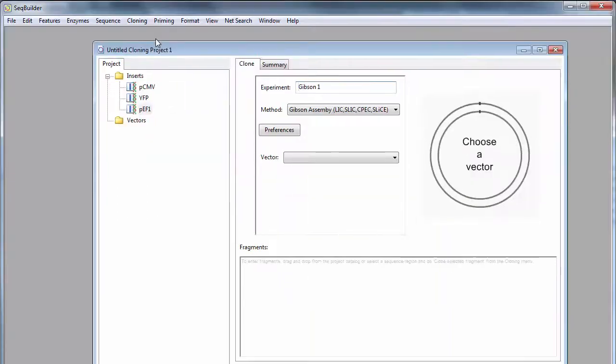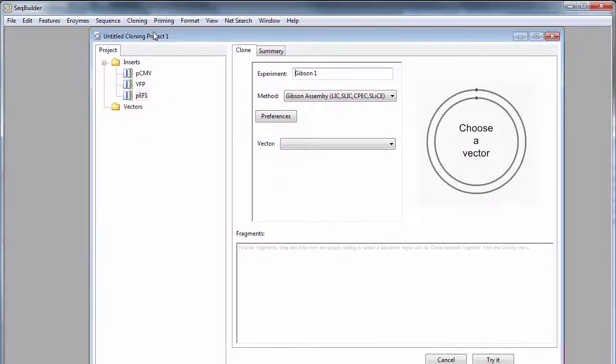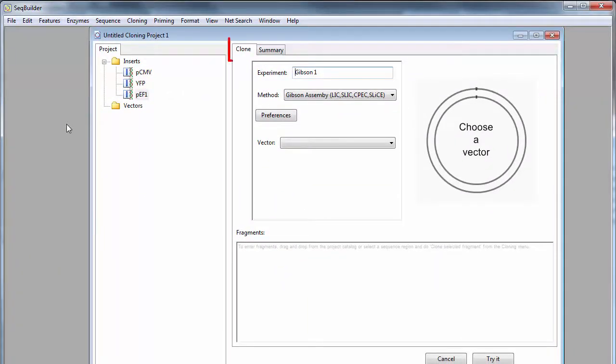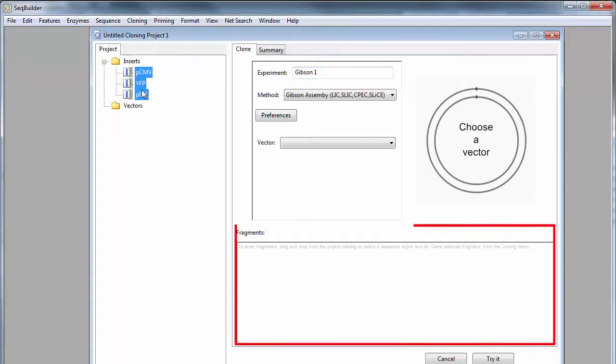After selecting your cloning method, two new tabs will appear in your project window. Add your inserts to the Fragments section by dragging and dropping.